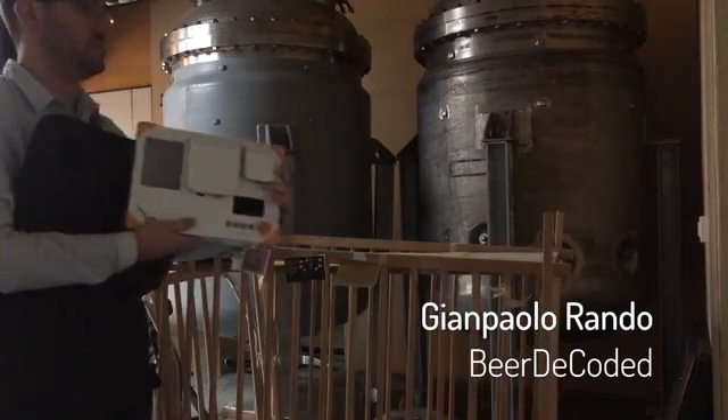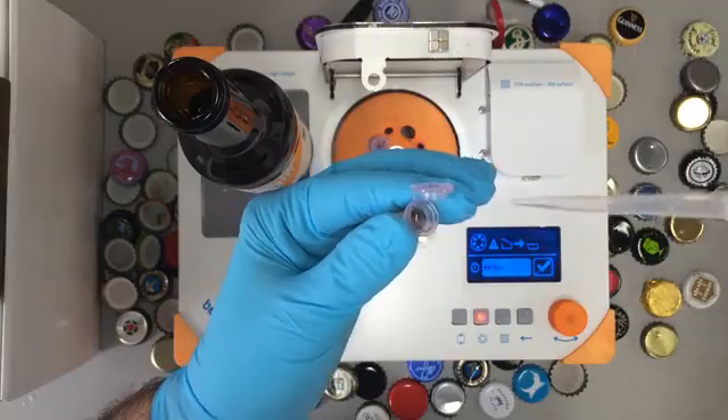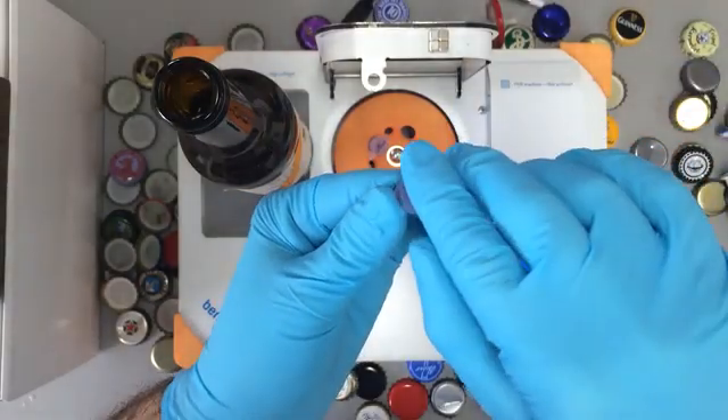My name is Gianpaolo. I'm the founder of Beer Decoded and I'm on a mission to understand the genomics of beer. I often go to remote locations where I collect DNA samples and then bring them back to the lab for analysis. Now with the BentoLab, I can actually run some of these analyses in the field.